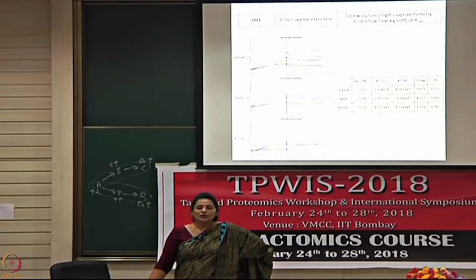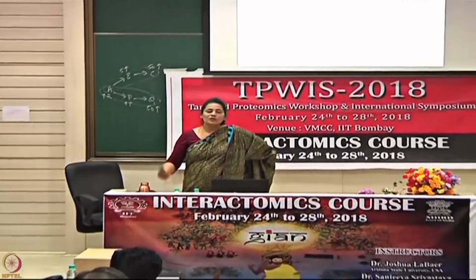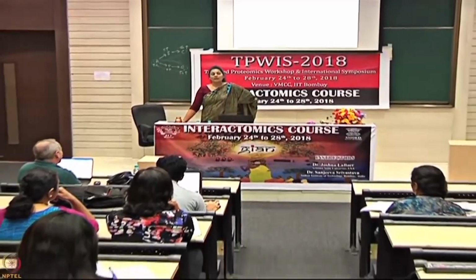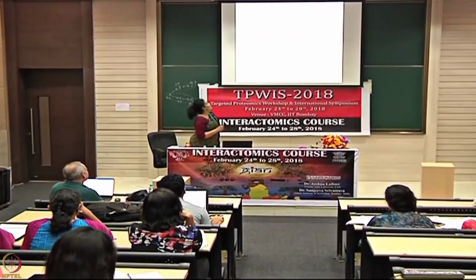Saturation. Do we call it a saturation? Saturation by definition is? All the sites are occupied. Will that happen when you have lower concentration than Kd? It won't. So what do we call that? Equilibrium? Yeah? So you need to achieve equilibrium.